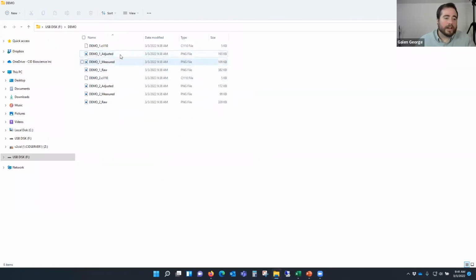So what you can do with this data is put it into other software if you want, with other algorithms for gap fraction, other thresholding algorithms. You can easily do that. You can also post-process the images in some sort of photo editing software to even further increase the contrast between the sky and the canopy. There's a lot you can do in the post process here, because these are the actual image files. You can do a lot with different software.